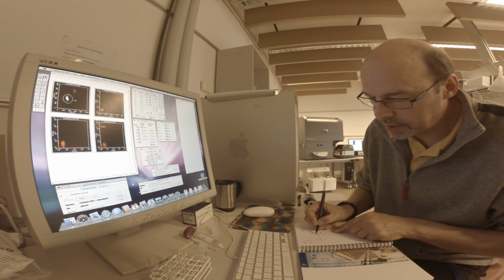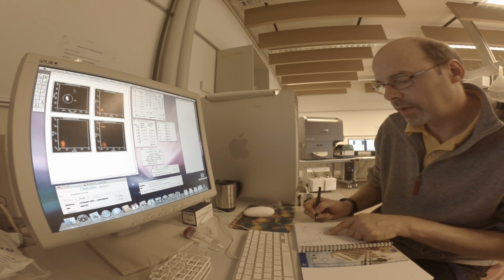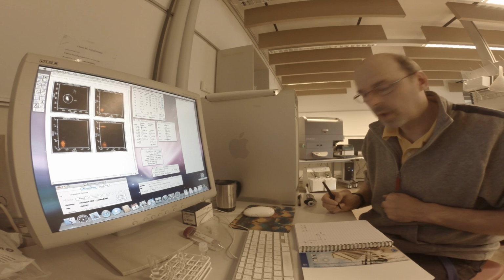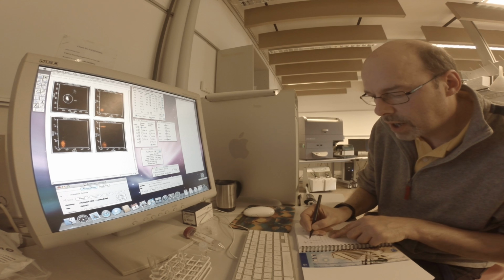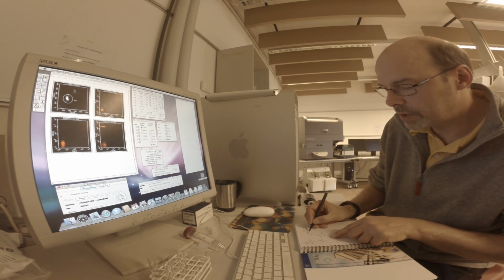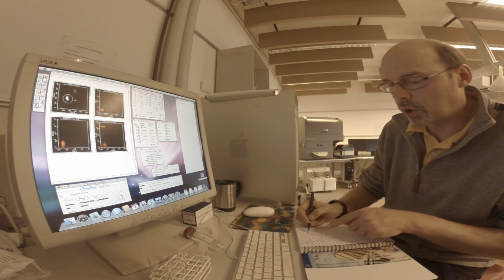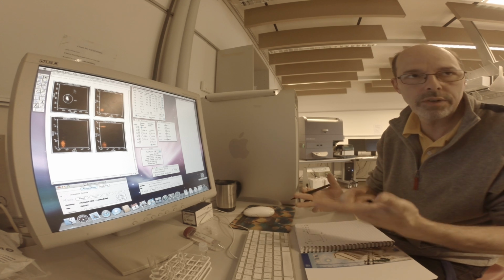And it will be close to 0. And now we are taking this one dot. So it will be, say, 725. And it's not 0, so like this. All right. Because now it has moved out on the FL3 axis, right? And the next dot that is lying here, that will be 10, 10, 10, and 725. You see the concept? Yeah. And of course you also have a value for the forward and the side scatter. That's the 6 values that you actually get out of it.